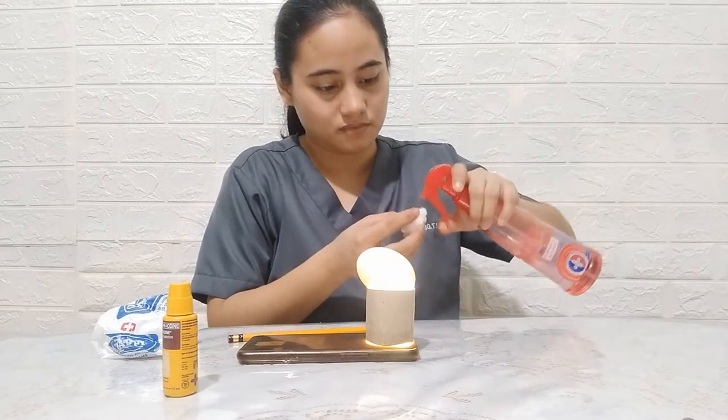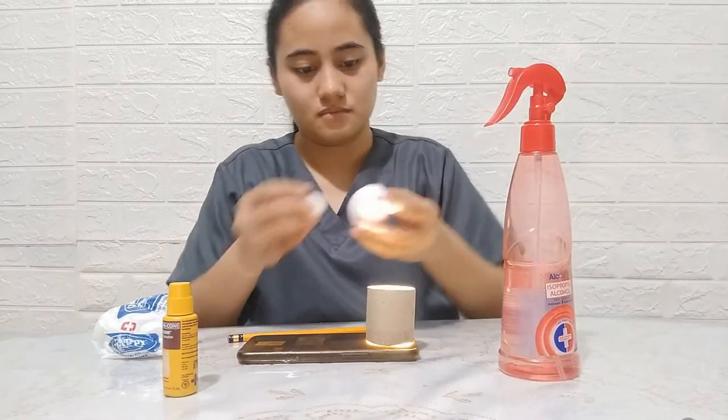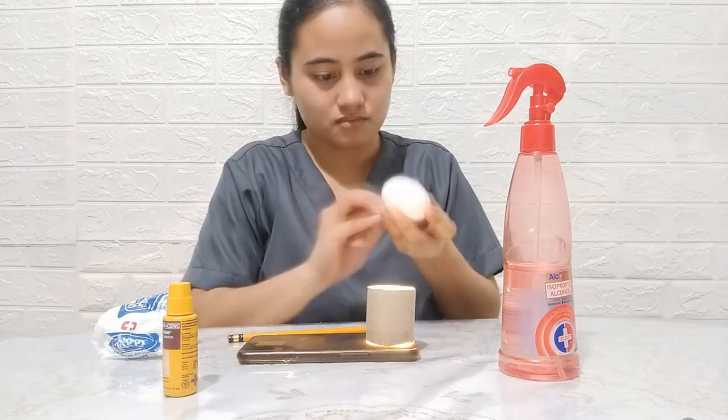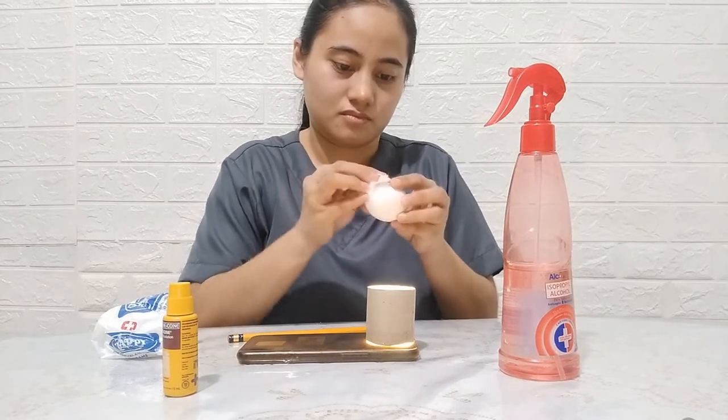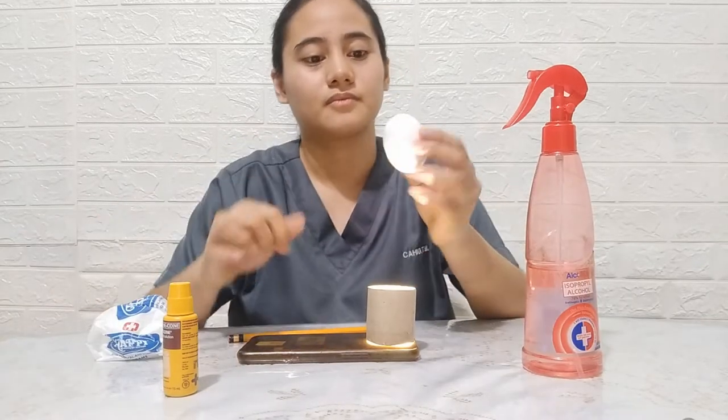Prepare the egg. Clean the surface of the egg by wiping a cotton wet in alcohol to make sure the egg is free from any dirt. Allow the alcohol to evaporate.